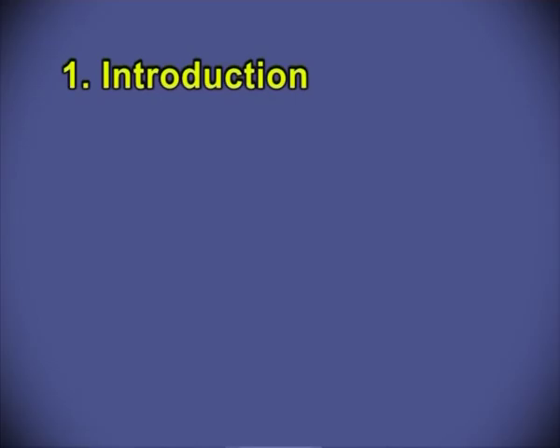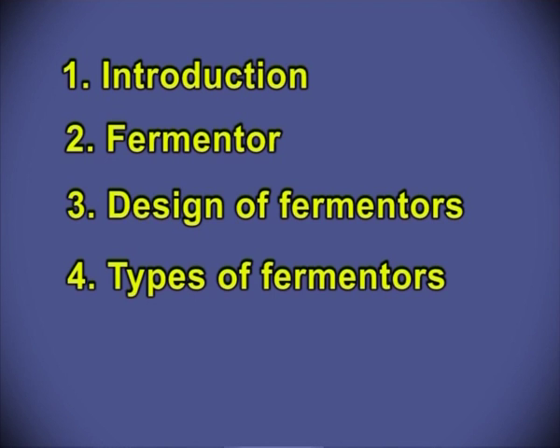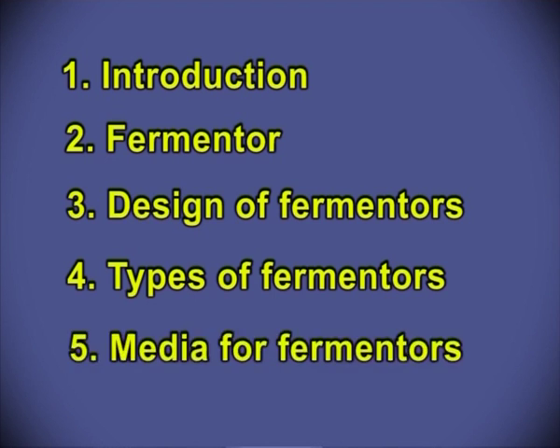Today, the topic fermenter, design, types and media for fermenters shall be discussed under the following subheadings. 1. Introduction. 2. Fermenter. 3. Design of fermenter. 4. Types of fermenters, and at last 5th, media for fermenters.